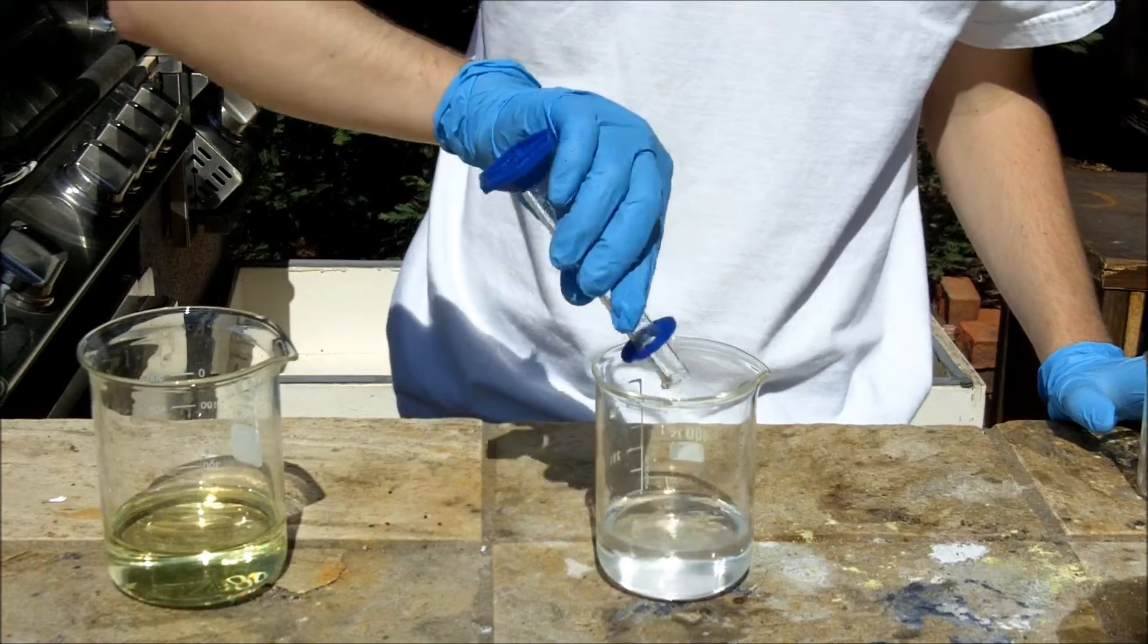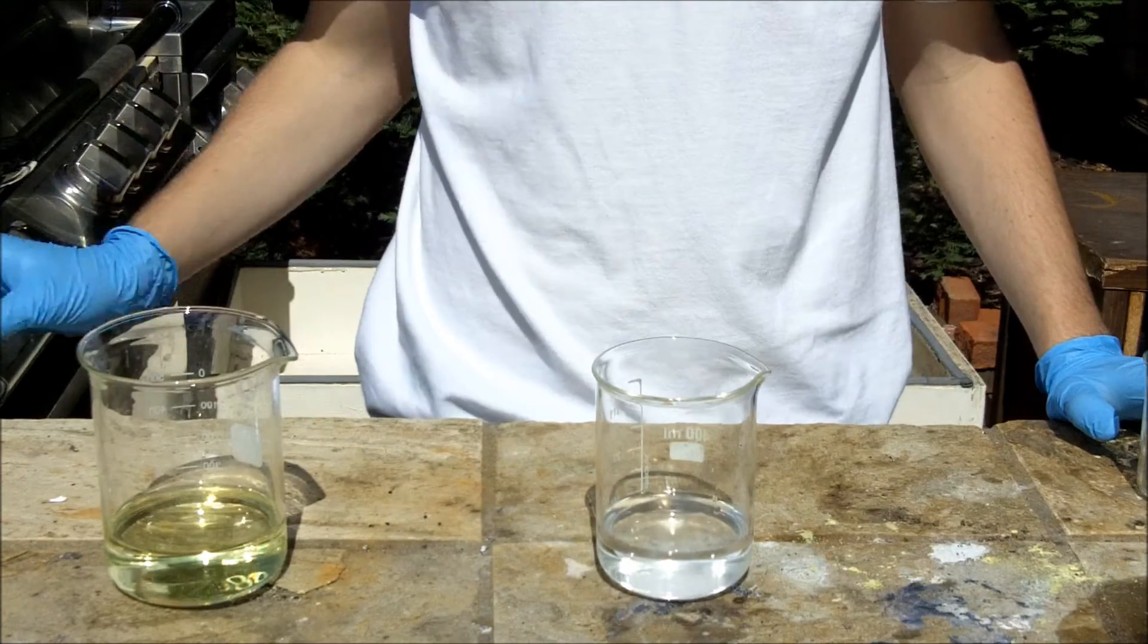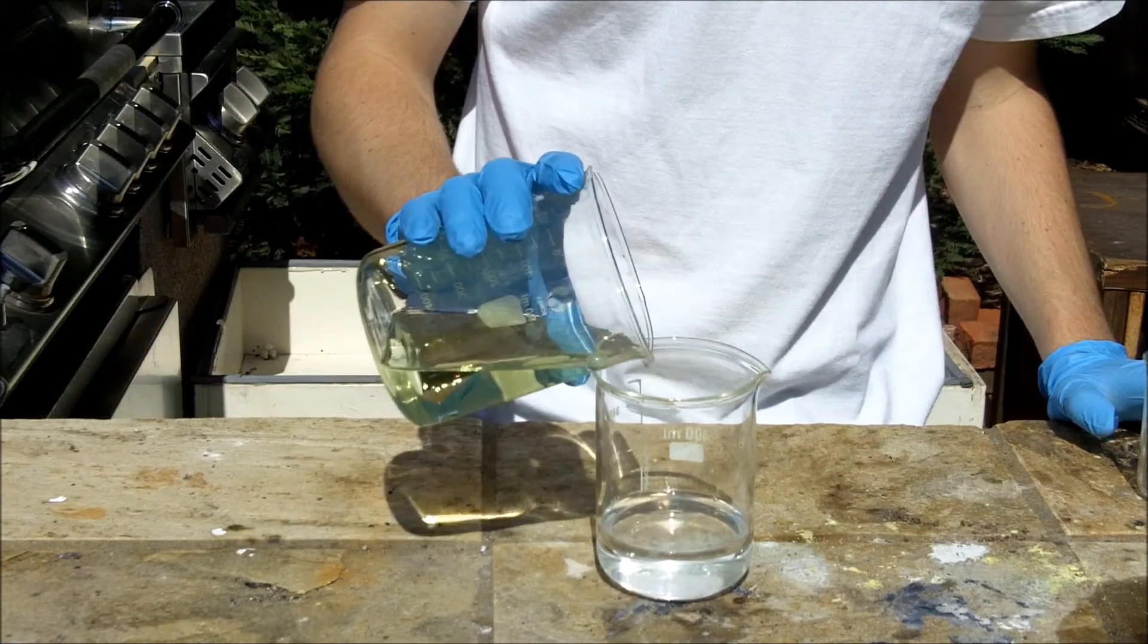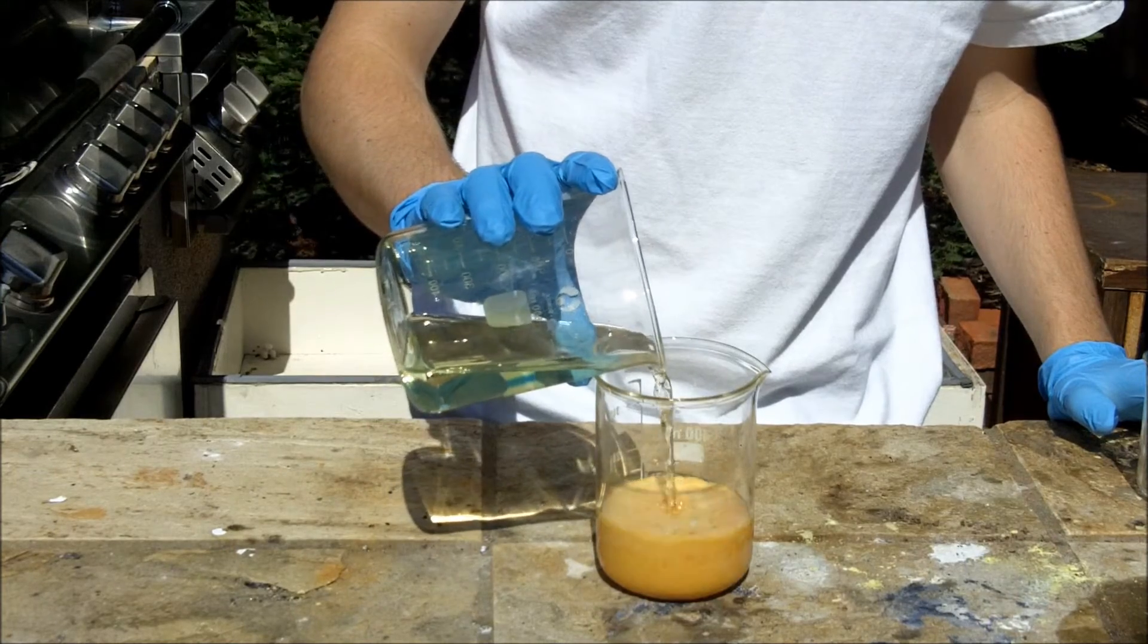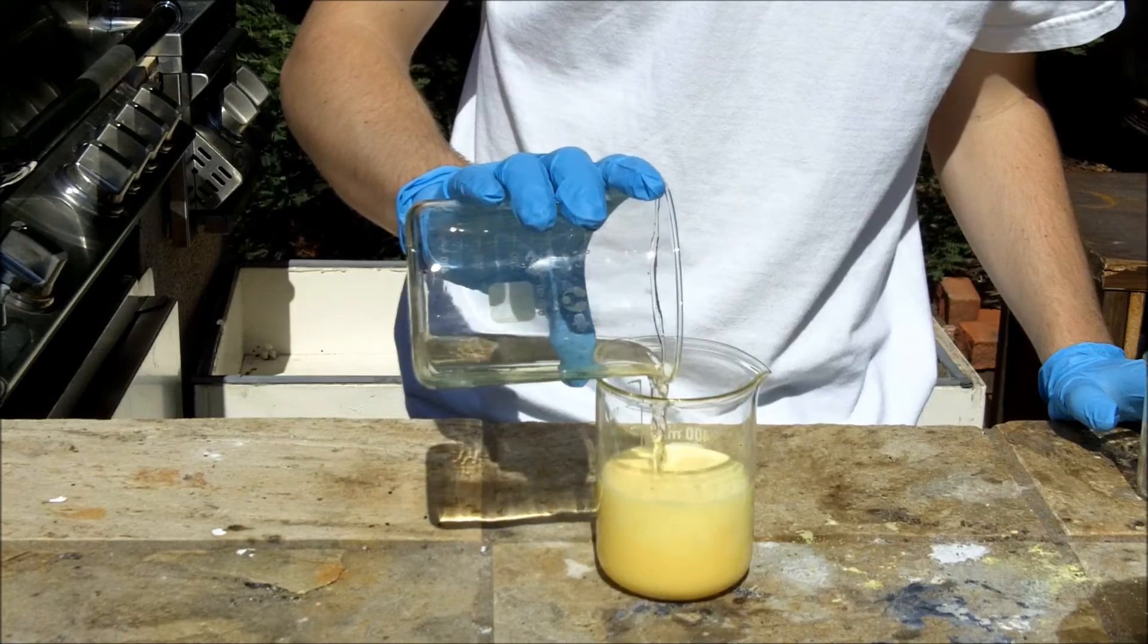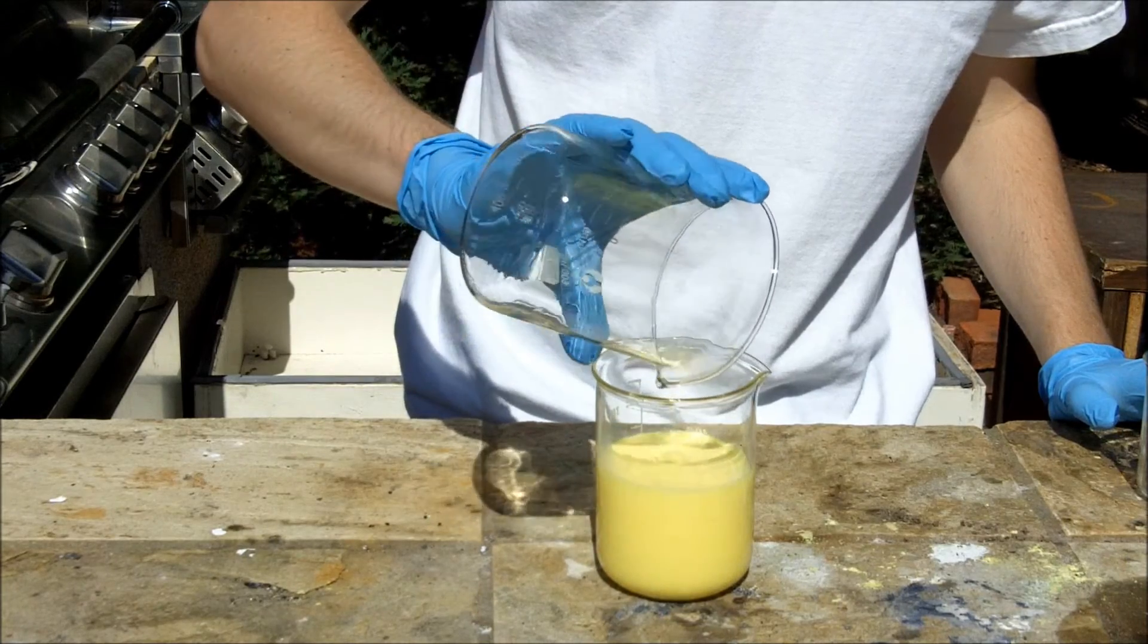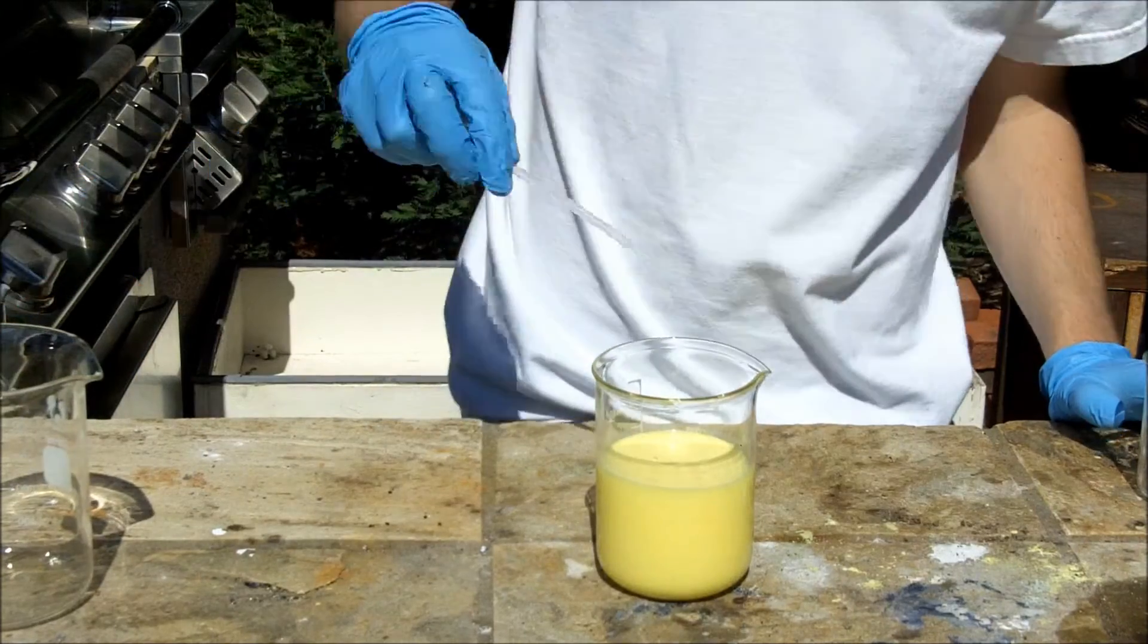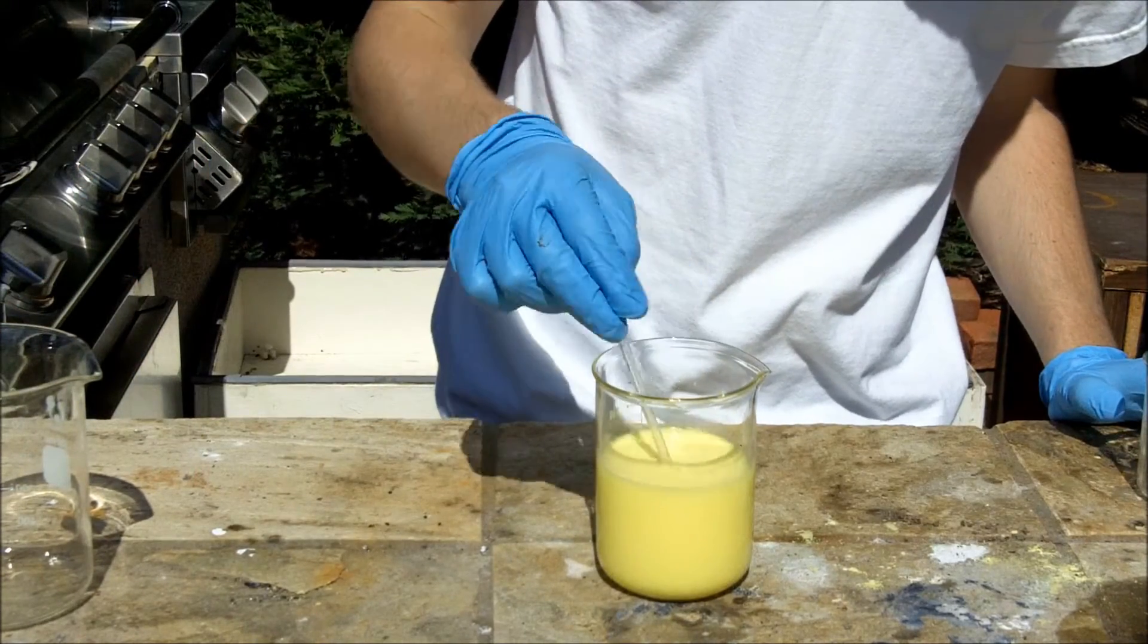In with the acetone. And now with the bleach. And we get a nice color change there. You can definitely see the color of iodoform.